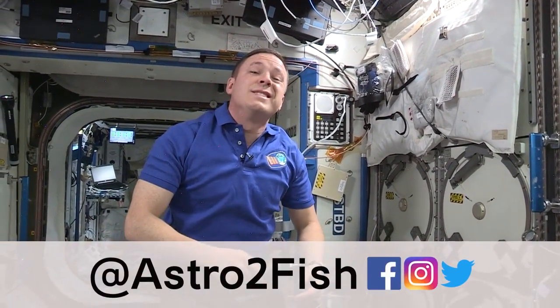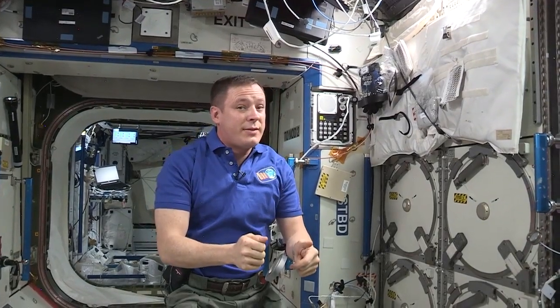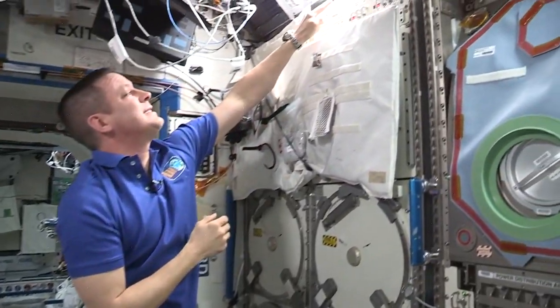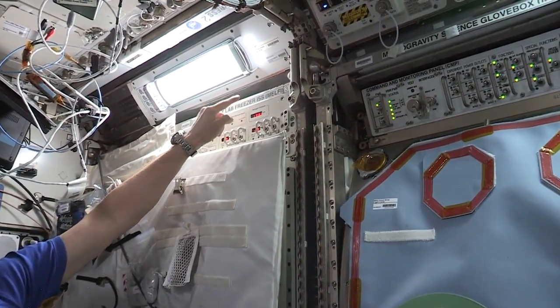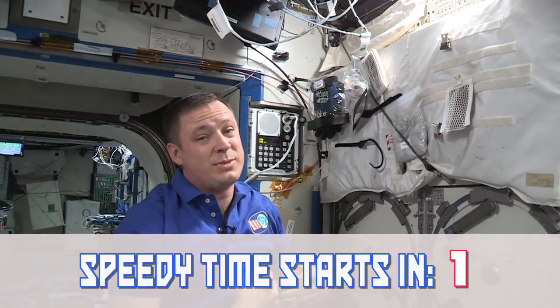Hello and welcome to another speedy time. Today we're going to talk about one of the most useful tools we have on the space station, the minus 80 lab freezer ISS MELFI, or as I like to call it, the freezer of awesomeness.